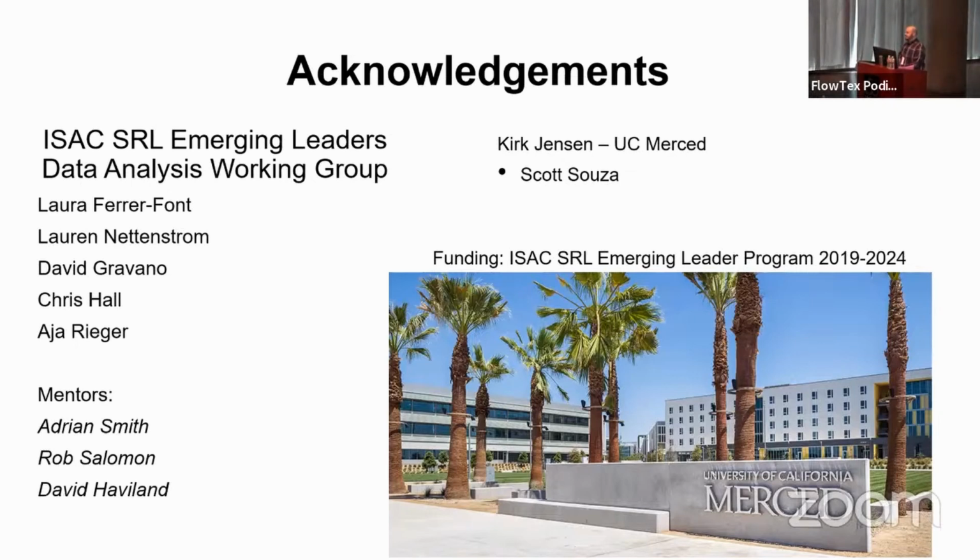That's a really tough one, because I feel like I can only support certain platforms at the moment. I just don't have the ability to do all the platforms. I have what's available to me, and as of the moment, that's FlowJo. I do have some people in FCS Express who bring their high dimensional data, and that's a tricky one. I feel like I can't support them as well. I can give them a little more theoretical assistance, but the hands-on assistance is difficult.